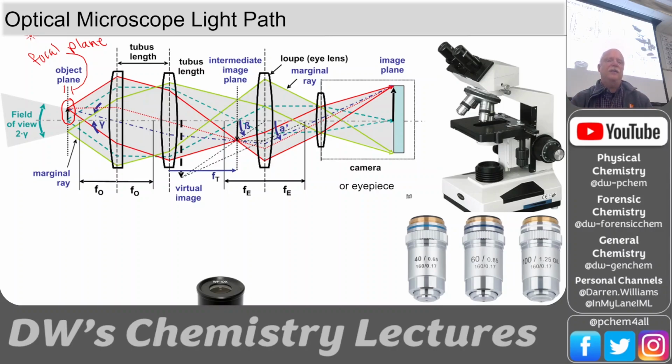And it's interesting. Sometimes you can look through things. Like you have a cover slip, you have your sample, and you have the bottom of the microscope, and you're zooming in, and you're focused on the dust on the cover slip, and you think, wow, there's nothing here. Well, you're not even looking at your sample. You can't even see your sample, even though your sample's right in line with the beam. You don't see it because the focal plane is not down where your sample is.